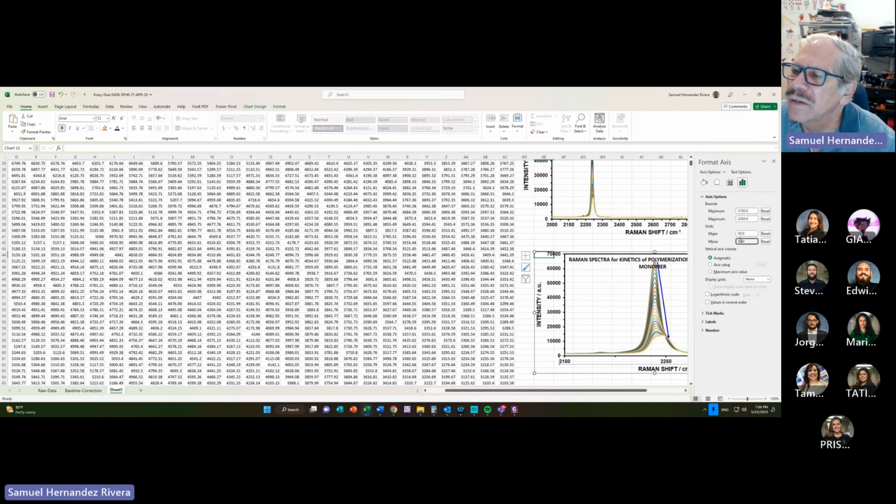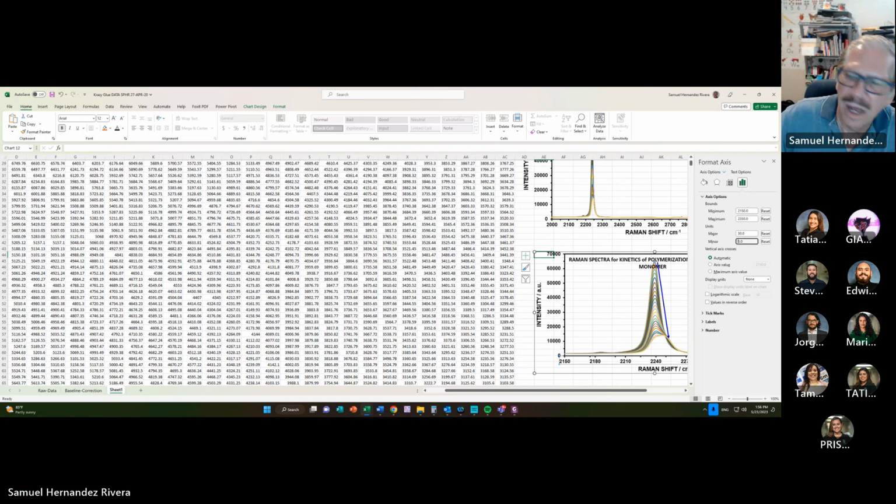Half of 50 is 25. No, we can do better than that. Let's go to 30. And half of 30 is 15. And we're done.